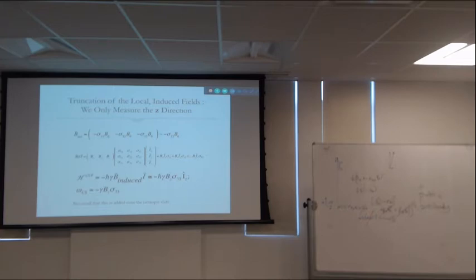Okay? So we're getting rid of weak orthogonal fields when we don't think that they're going to be resonant. And it could be a mistake if it's near resonant and you didn't notice. So there'll be some gray zone in this. Sometimes it's crisp, that's resonant, that's not, and sometimes there's a gray zone and we can all argue about the gray zone. But for this class, I think we'll have pretty crisp examples. That's not resonant, that is resonant.